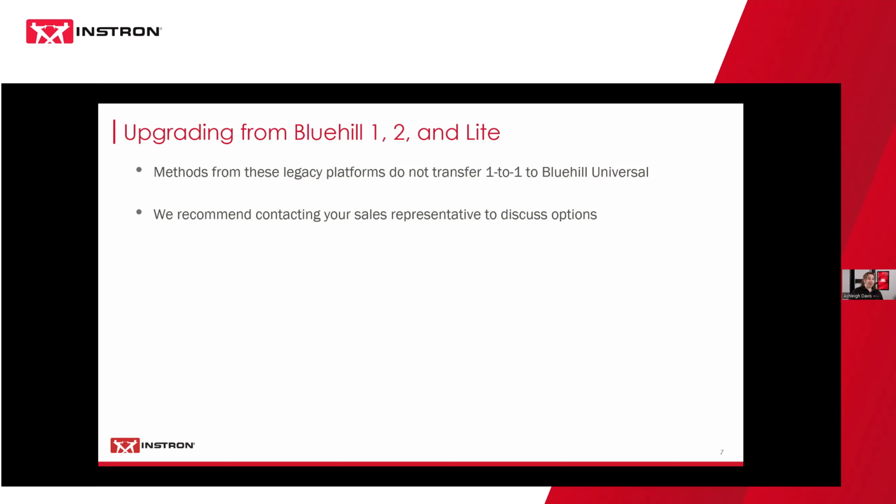But let's say that you have more than 5 methods. Maybe it's only 8 methods, or maybe you have 20 plus methods. Again, this will be something you'll want to talk to your sales representative about. If your field service engineer is changing 5, and they're training you on how to actually convert methods, hopefully the rest of them you should be able to handle on your own.